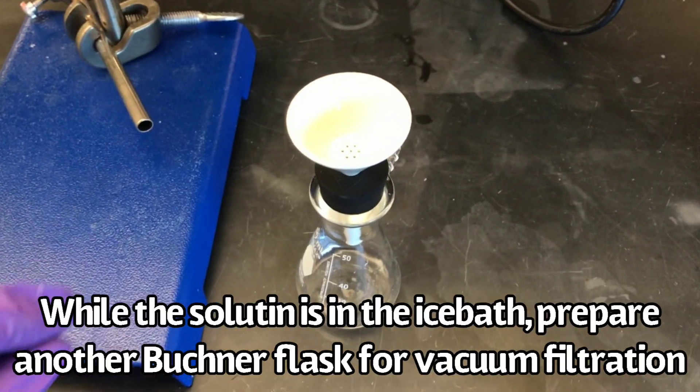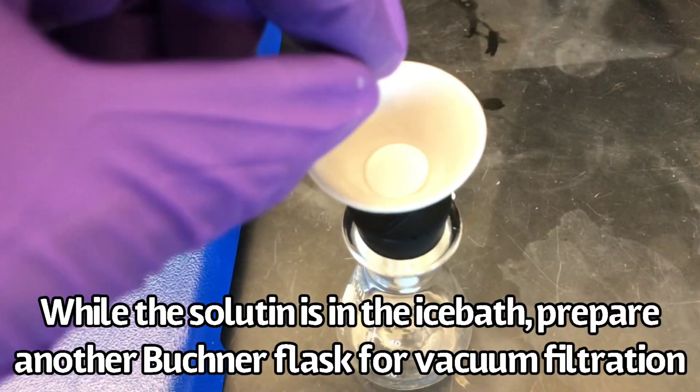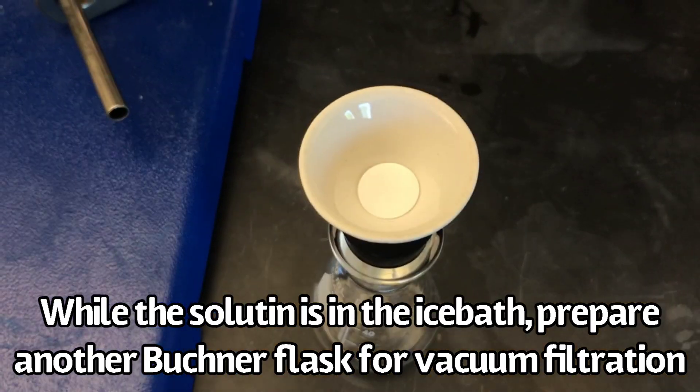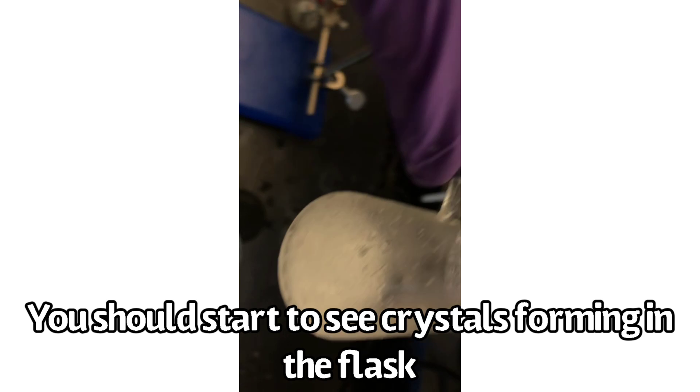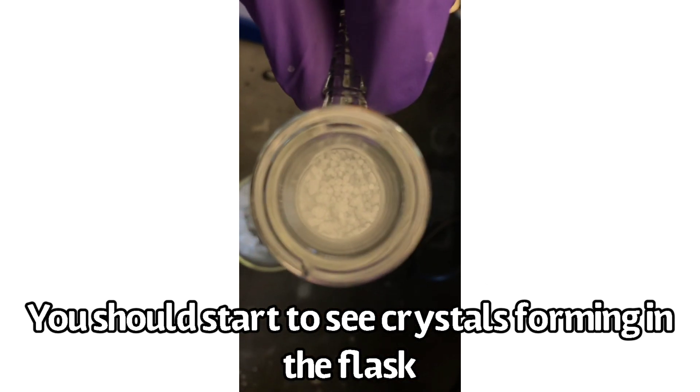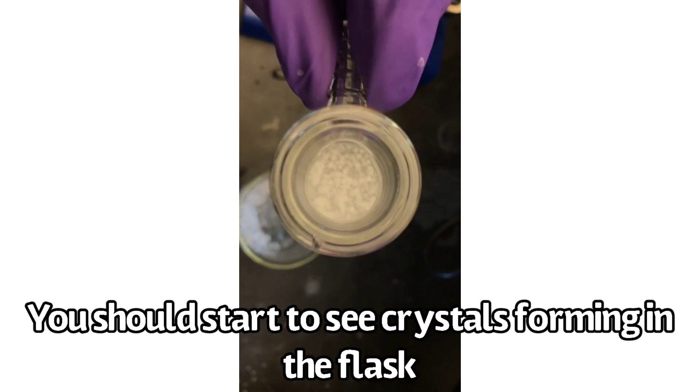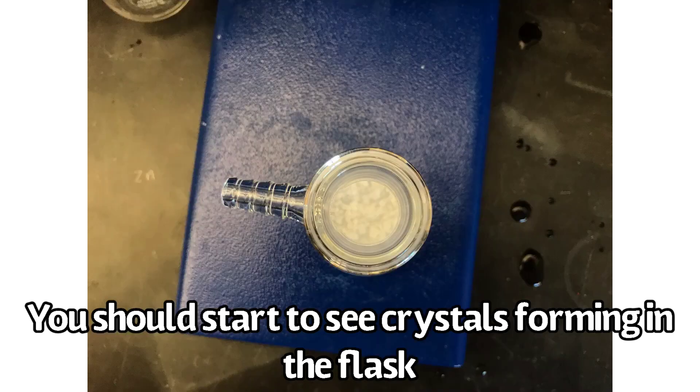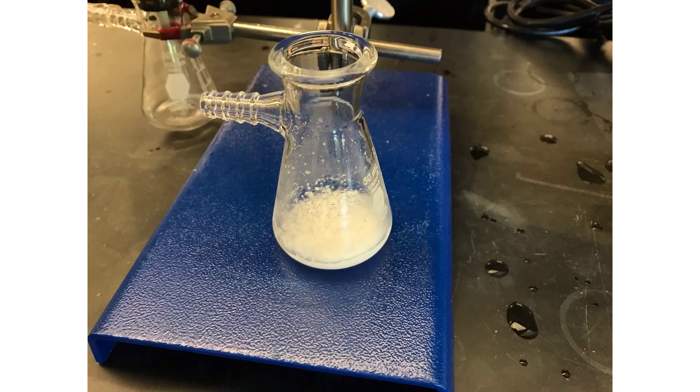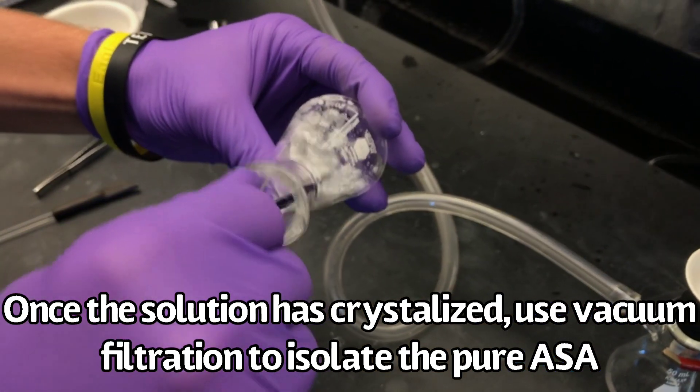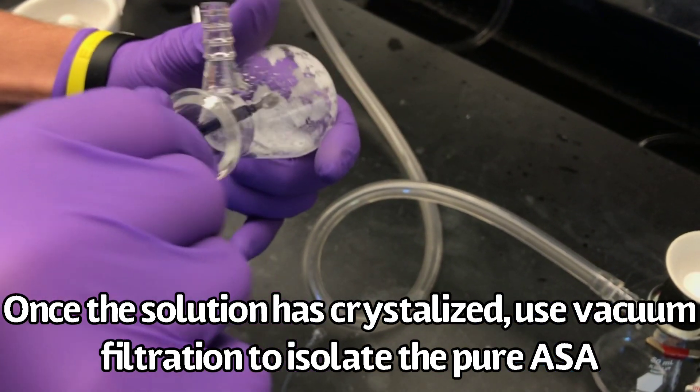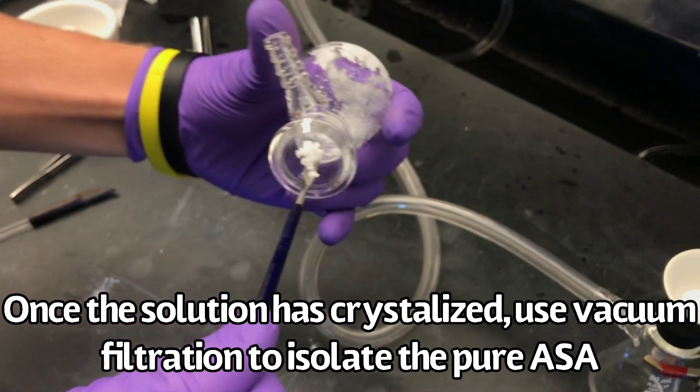Prepare another Bushner flask for vacuum filtration. You should start to see crystals form in the flask. Once the solution has fully crystallized, use vacuum filtration to isolate the pure acetylsalicylic acid.